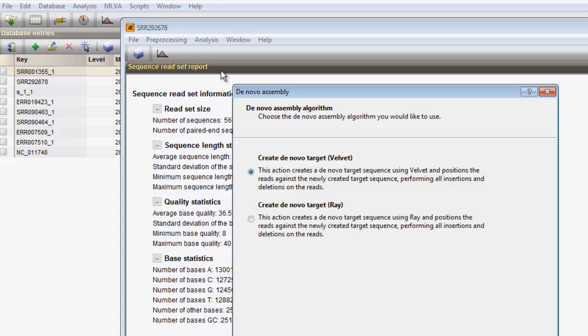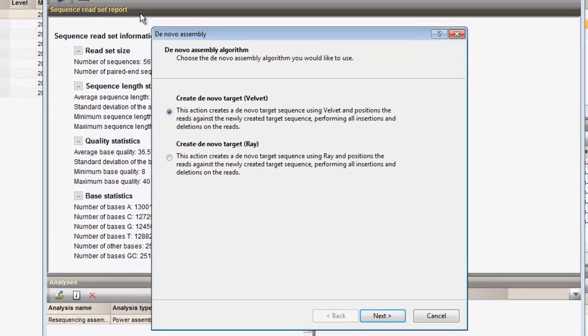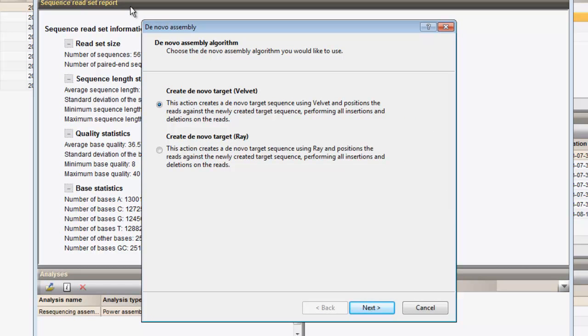After the analysis is launched, a wizard pops up, querying for the different parameters. Within BioNumerics, two de novo assembly algorithms are incorporated: Velvet and Ray.